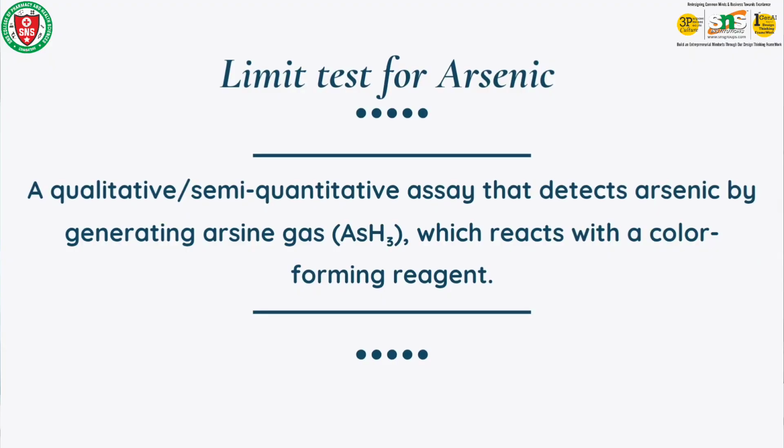Hi everyone. In this lecture, I'm going to briefly discuss the limit test for arsenic. The limit test for arsenic is one of the heavy metal limit tests, which is done to identify the presence of arsenic impurities in pharmaceutical substances or pharmaceutical products.